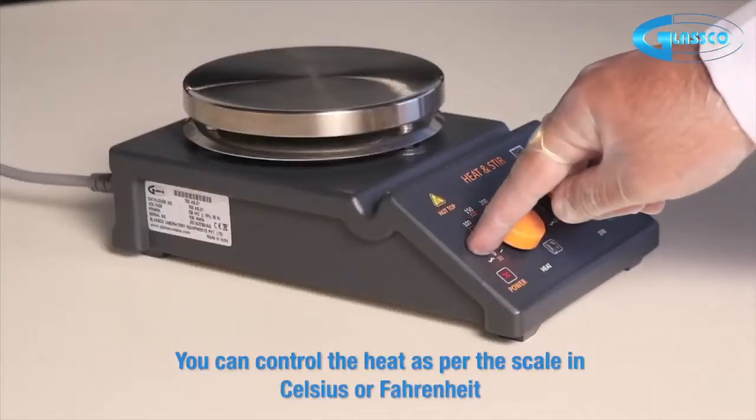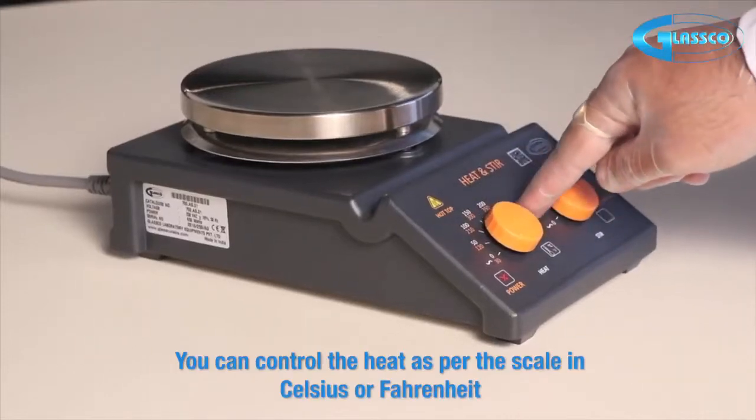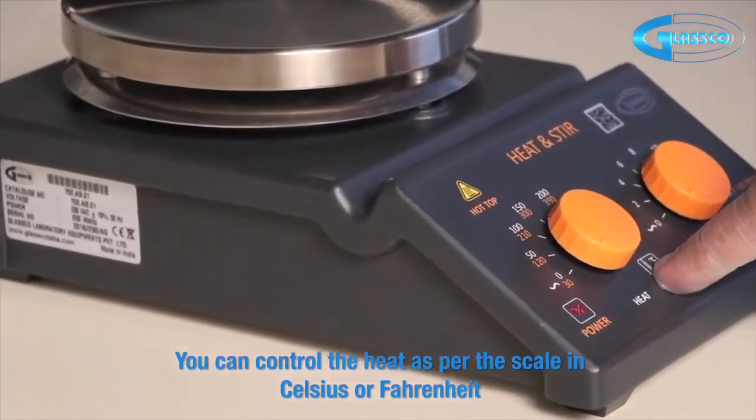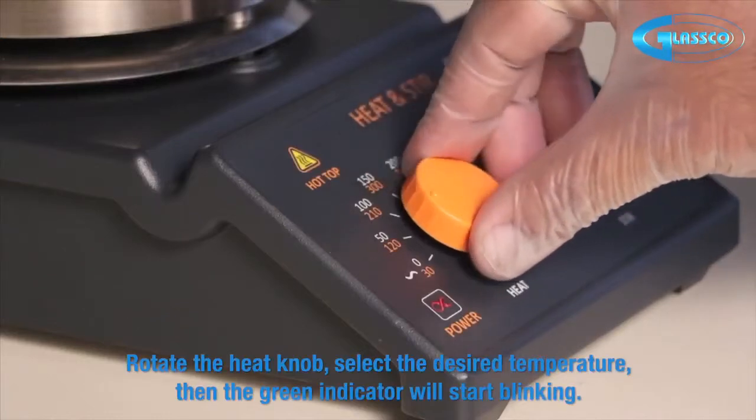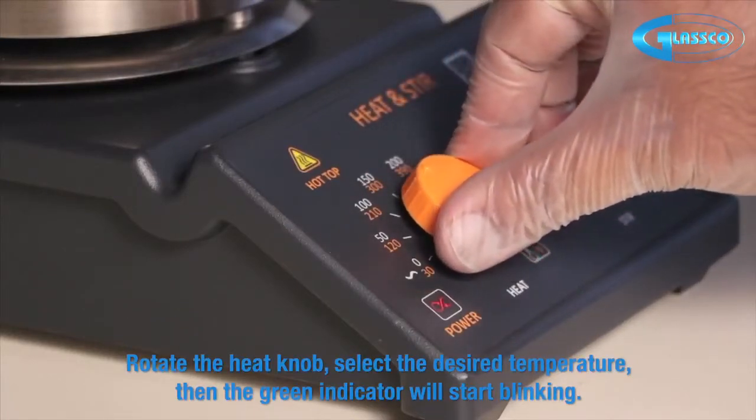You can control the heat as per the scale in Celsius or Fahrenheit. Rotate the heat knob and select the desired temperature, then the green indicator will start blinking.